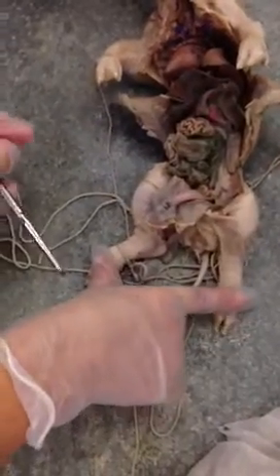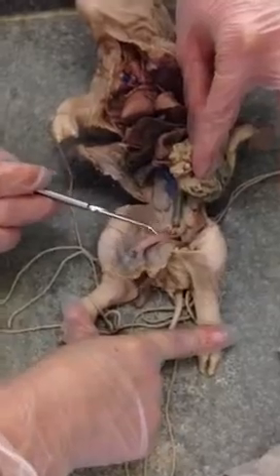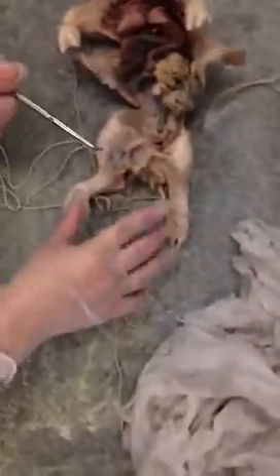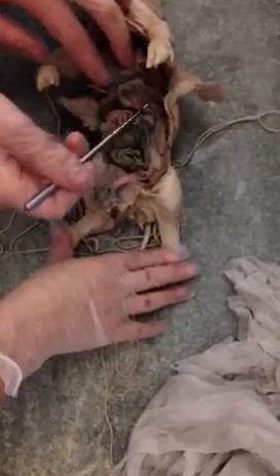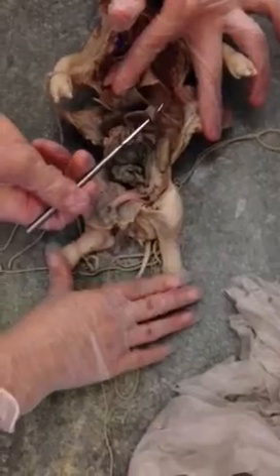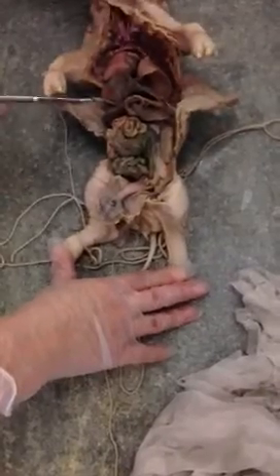Okay, now on to the excretory system. So again, we have the kidneys on either side of the intestine, which go up to the urinary bladder. And now for the circulatory system. So we have the spleen, which is this flap right here. And then we have umbilical arteries again, two on either side of the bladder, and the umbilical vein, which has been cut.